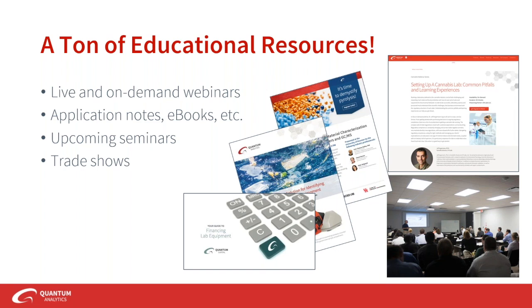Why is there such a dramatic price difference between energy dispersive and wavelength dispersive XRF instruments? We talked about that a bit in the presentation, and what it boils down to is there's a lot more involved in a WDXRF than just the number of parts that go into that unit. It takes a lot more to align it.